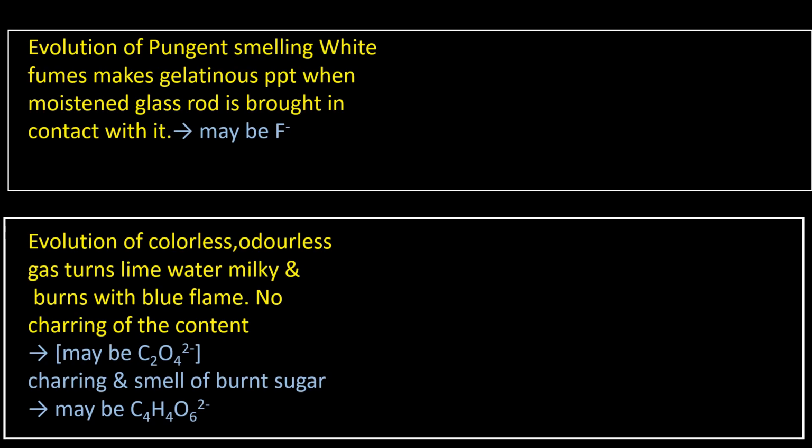What is happening here? First of all, as usual, I am taking sodium fluoride plus concentrated sulfuric acid. Then it will form HF, hydrogen fluoride, and here you will get sodium sulfate.